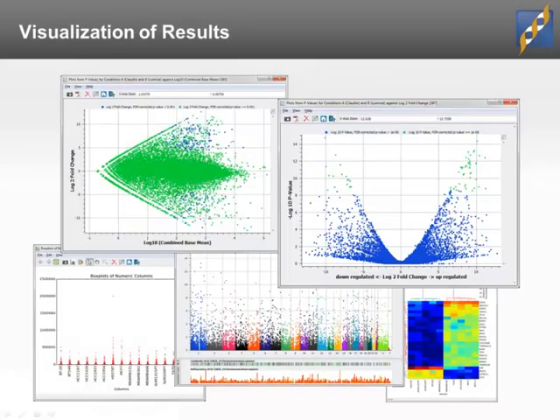Here is a sample of the visualizations that can be created using our tutorial, for RNA-Seq quality assurance and with the output of analysis methods. In the upcoming demo, I will show you how to create a dendrogram with heat map and the volcano plot, which is a plot of negative log 10 p-value versus log 2-fold change. The top genes will then be selected from the volcano plot and the BAM files interrogated in Genome Browse to determine if the genes are really differentially expressed or if something else was going on.